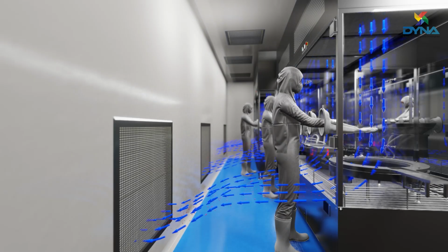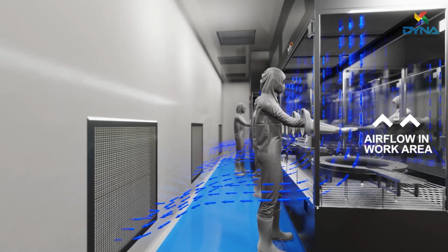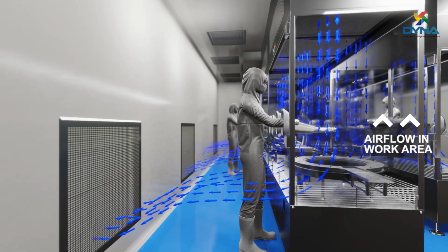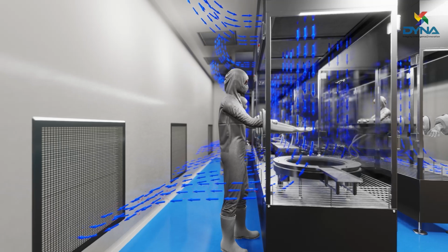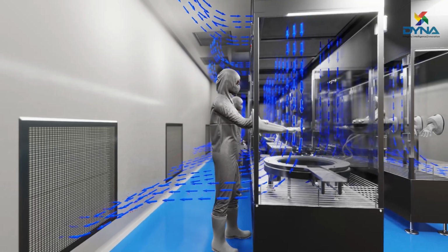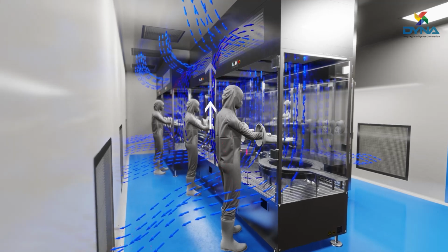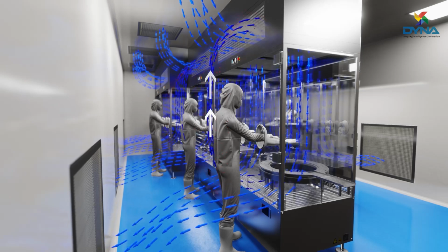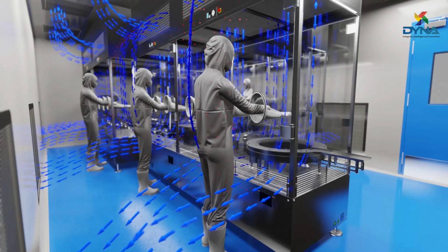However, there are situations where a significantly large volume of laminar air is needed within the work area to maintain sterility, compared to the air volume coming from the terminal HEPA filter. Due to this, a portion of the contaminated air inadvertently moves upward towards the laminar air flow unit suction zone, instead of following the intended path to the return air riser. This fouls the clean room.